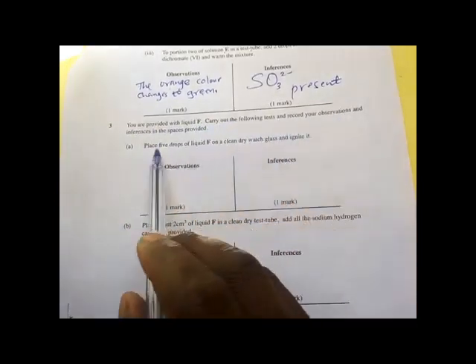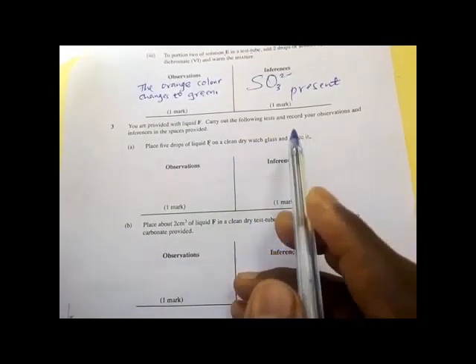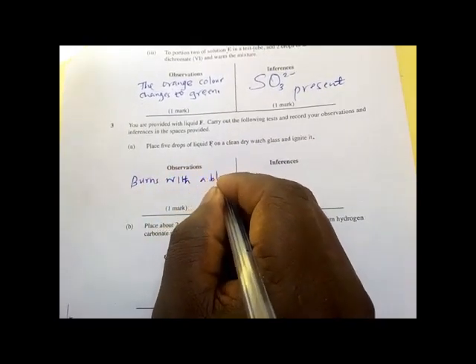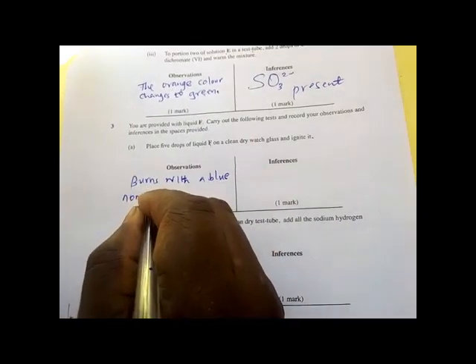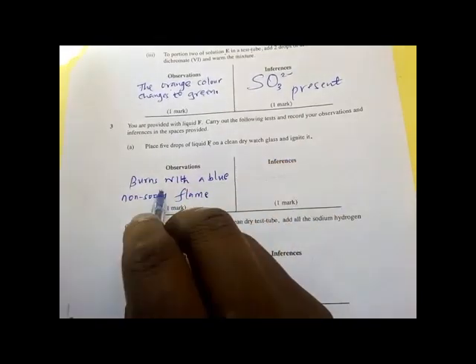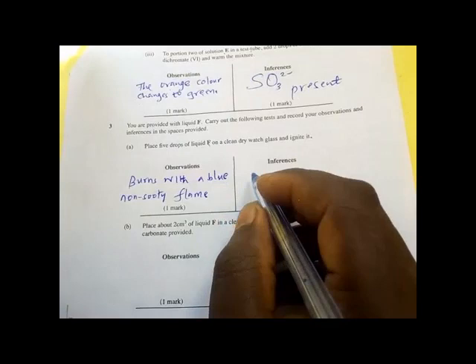Next, place 5 drops of liquid F on a clean dry watch glass and ignite it. The liquid burns with a blue non-sooty flame. So it is burning with a blue non-sooty flame, then it means it is a saturated organic compound.